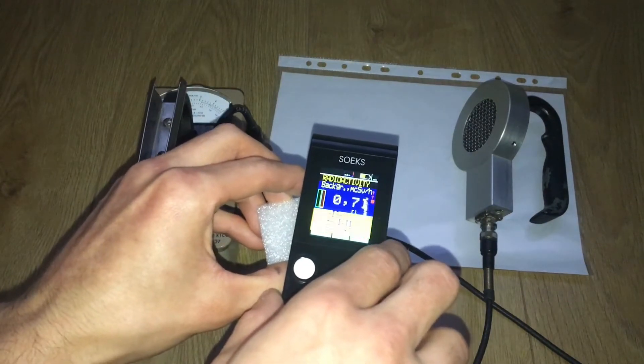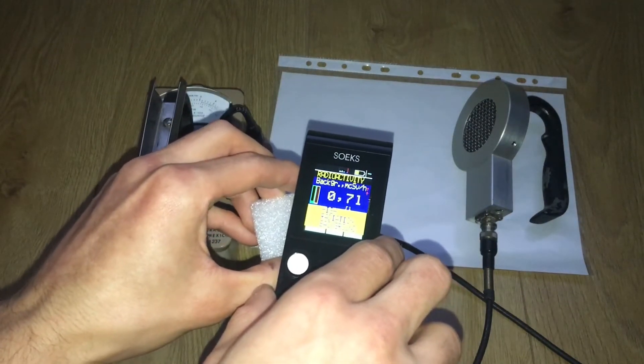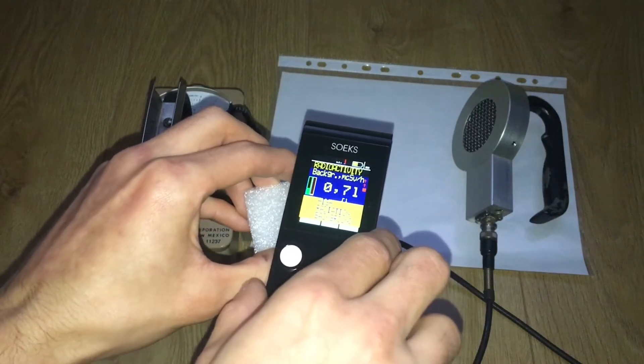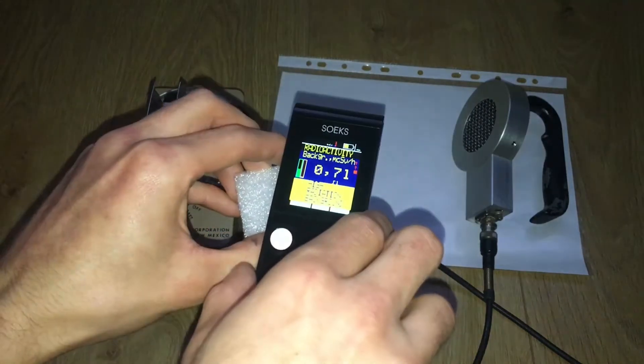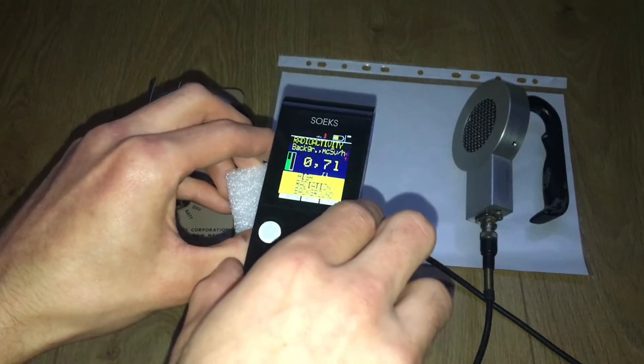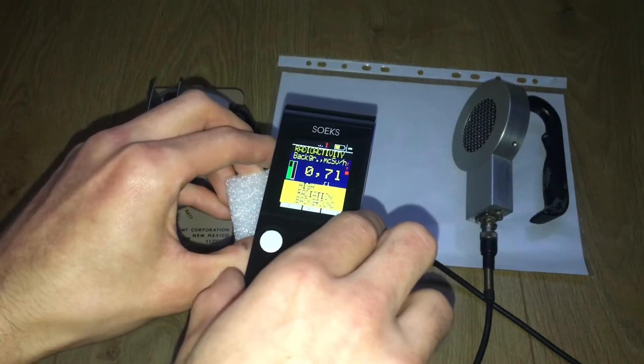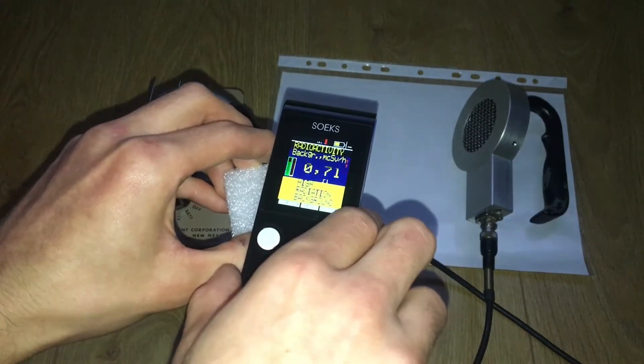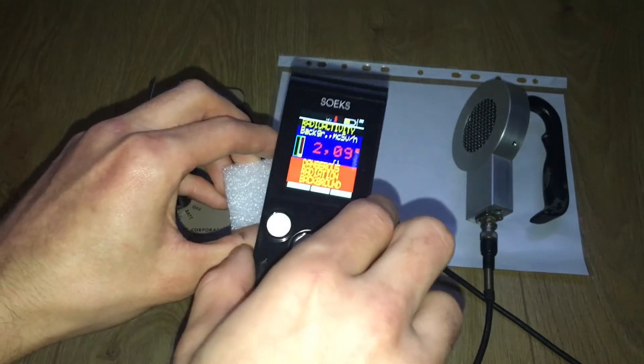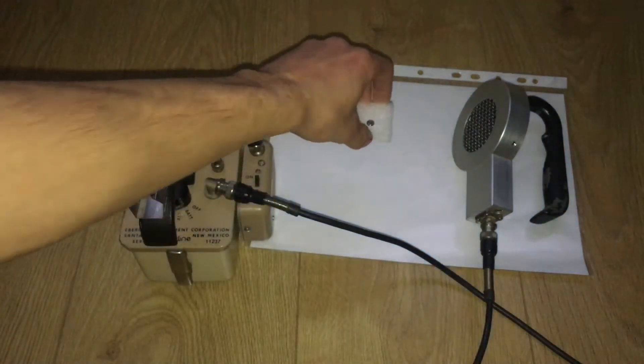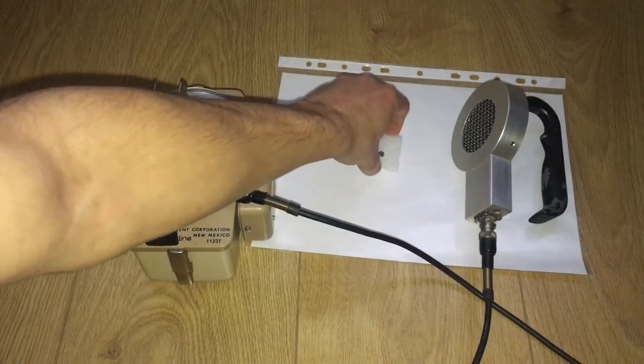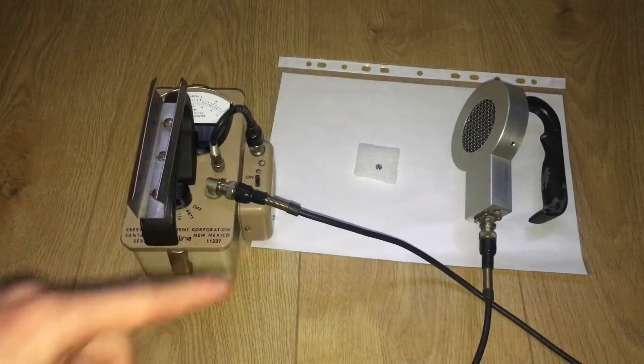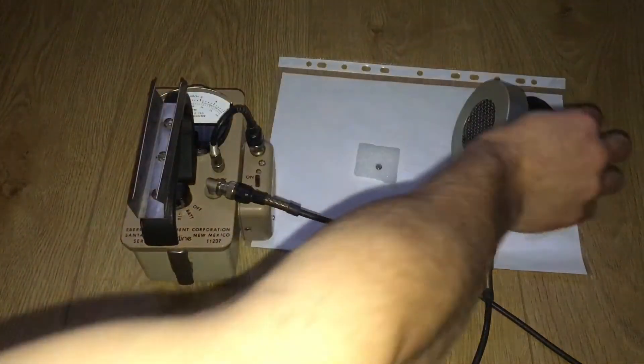Gammas, because americium-241 emits mostly alphas and some gammas as well. You're gonna have to get really close to it.